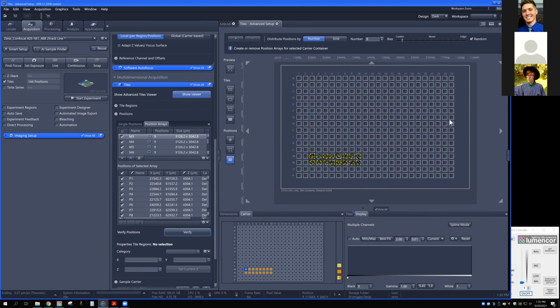They're what we call low base plates. A low base plate will basically have your imaging substrate flush with the skirt. And so you don't have that problem of hitting the edge of the objective lens against that skirt, because it's at the same exact height as your imaging substrate. They tend to be more expensive than the skirted, but it's worth it. If you really want to maximize your imaging space, then a low base or an ultra low base plate is the way to go.